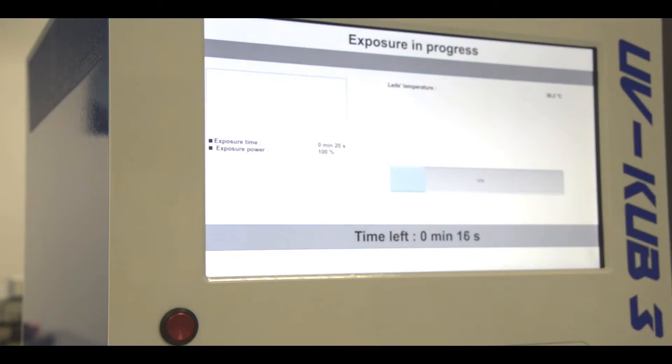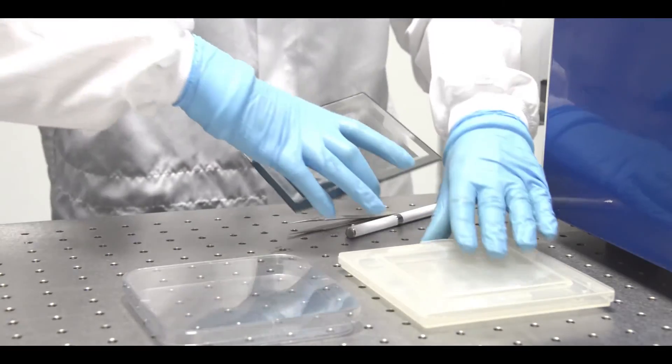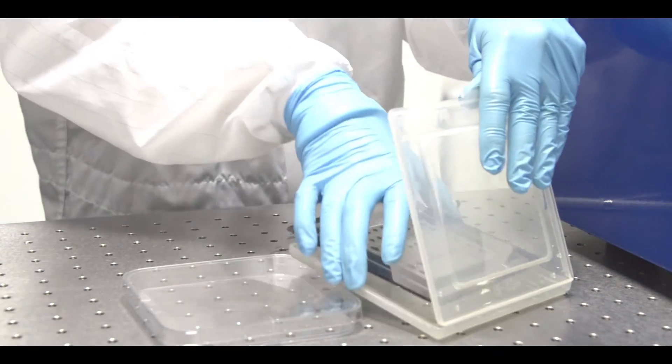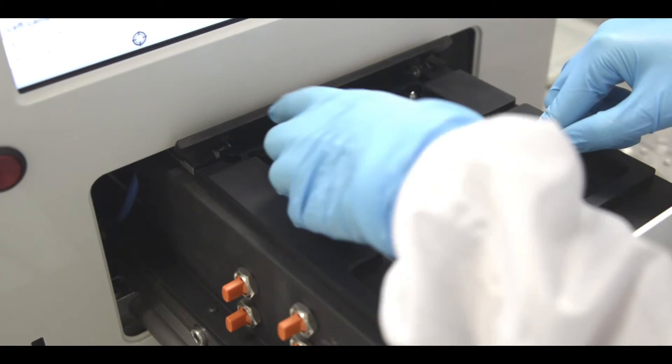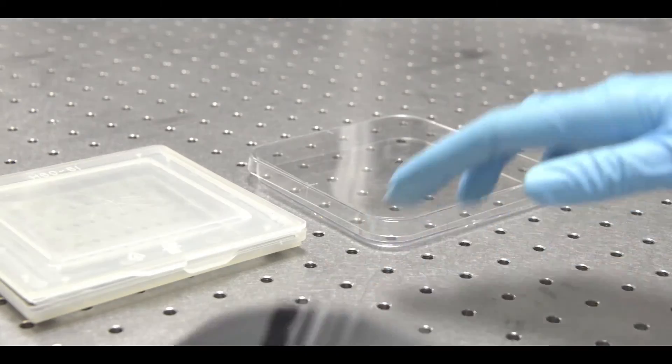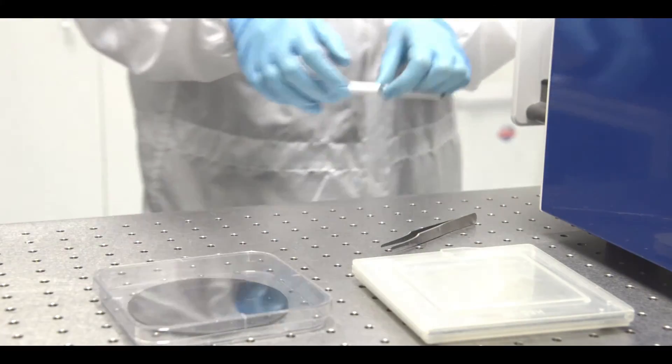Once the alignment is complete, you can adjust the distance of the masking with the pad or the menu and adjust the exposure settings or use the preset cycle. The latest generation exposure heads reach an illuminance of 40 mW per square centimeter with a beam divergence of plus or minus 1.8 degrees, enabling microstructures of less than 2 micrometers over the entire work surface.